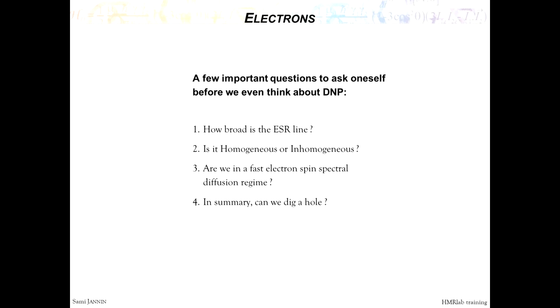And under MAS, they spin, so it's even more complicated because the electron spins get different frequencies during MAS rotation. And this rotation is also very important for DNP. It creates some additional effects that can lead to transfer of polarization between electron and nuclear spins. So it's much more complicated, and I'm really not familiar with that.